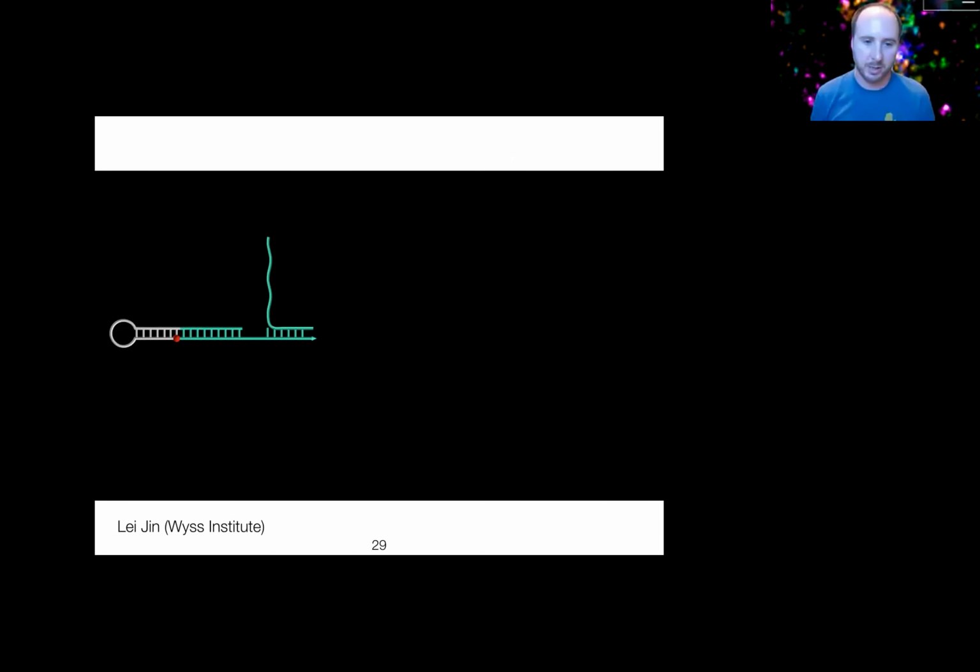And here's a quick animation showing you what happens if you add the same sequence to itself over and over. So instead of adding multiple different color domains, now we're just getting one long unicolor domain because it's the same sequence over and over.